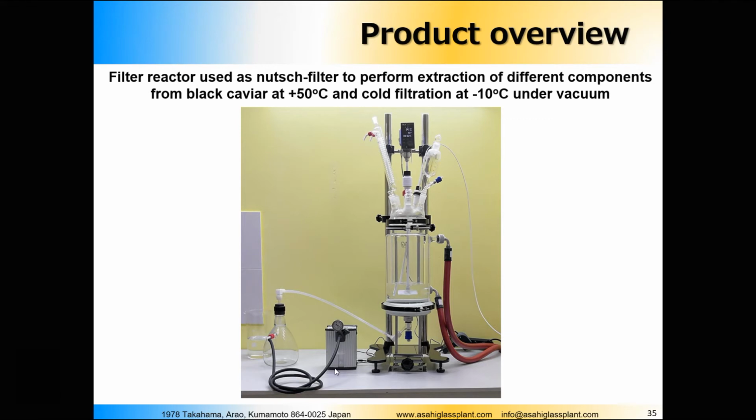So this is a very small chemical resistant vacuum pump, which has a small knob which can control the vacuum, and a small vacuum gauge here. And a small protection vessel which protects the vacuum pump. So very small one, and I do recommend this for this kind of application.